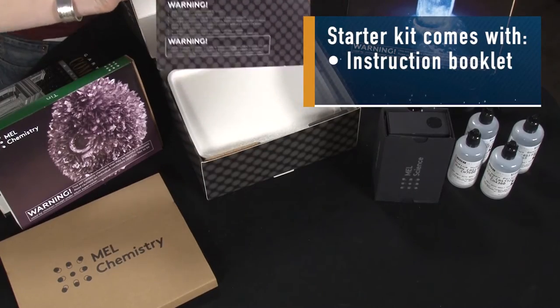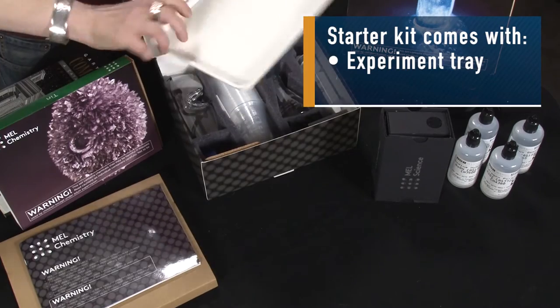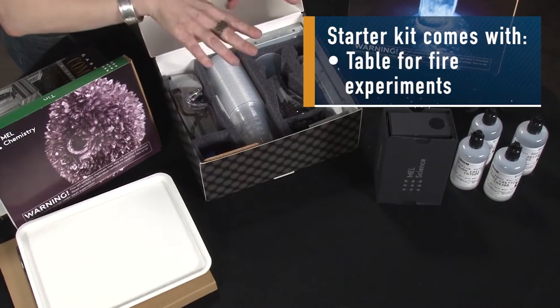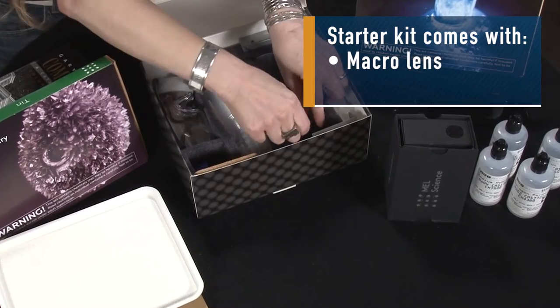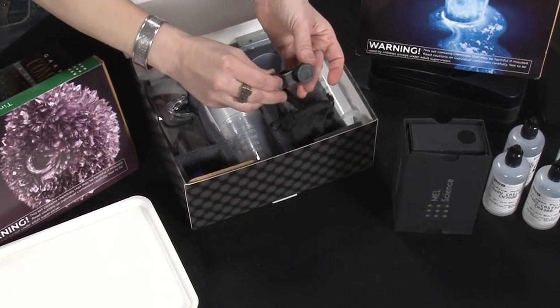There's an instruction booklet, a tray for putting your experiments on, safety goggles, beakers, cups, syringes, a little table for doing experiments that involve fire, and it even includes a little macro lens that you can attach to your smartphone so you can see the results of some experiments that might be a little difficult to see with the naked eye.